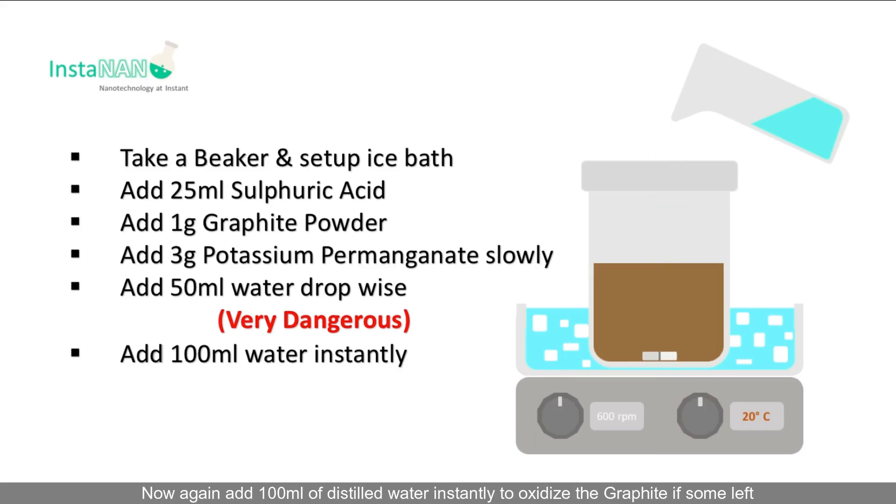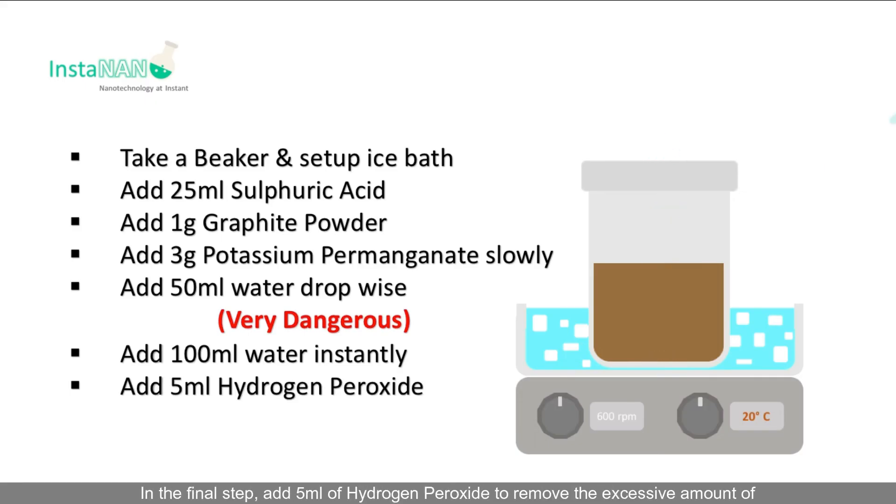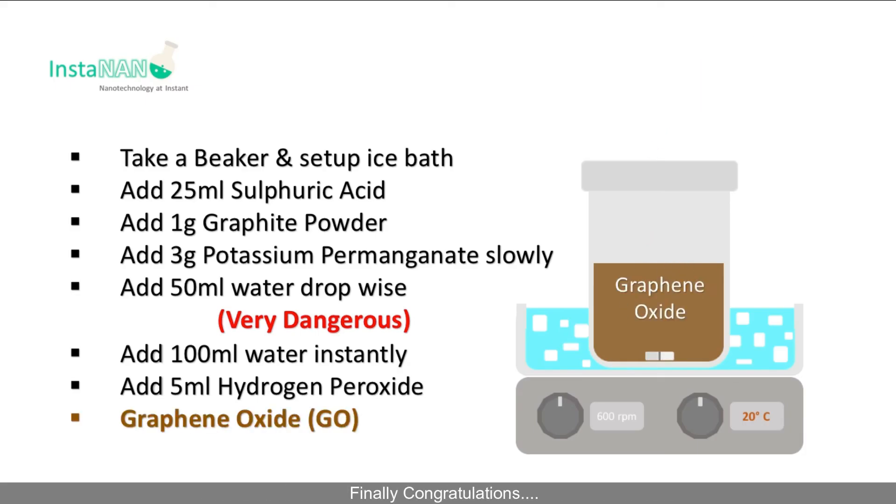Now add 100 ml of distilled water instantly to oxidize any remaining graphite. In the final step, add 5 ml of hydrogen peroxide to remove the excess potassium permanganate — in simple words, to stop the reaction. Congratulations, you have successfully synthesized graphene oxide via Hummer's method!